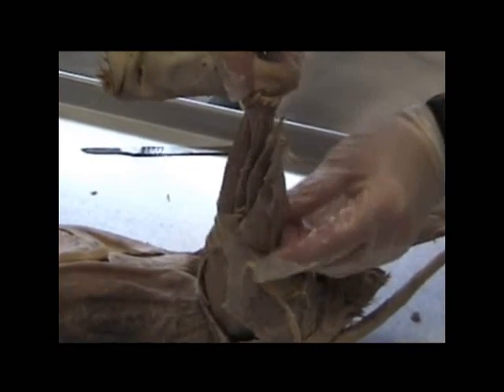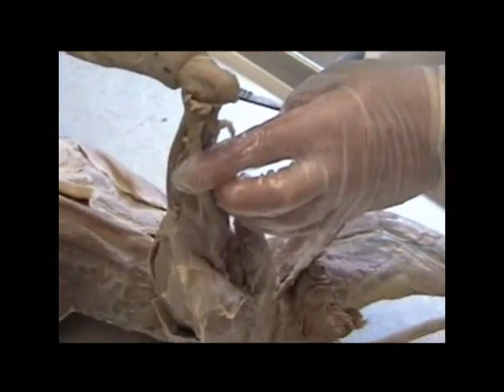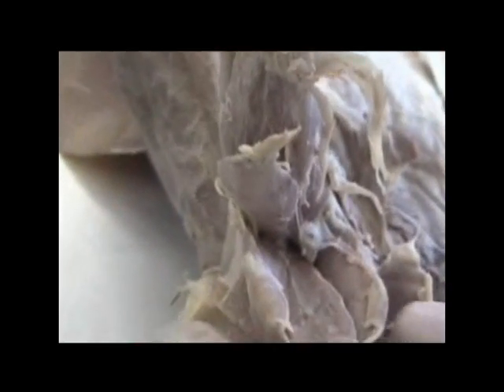Moving to the lower leg now, we have the calf group, and we have cut through the Achilles tendon or calcaneus tendon that wraps around the calcaneus bone, and now we can pull back those calf muscles, and we see the large calf muscle, the gastrocnemius, composed of the lateral head and the medial head of the gastrocnemius, and running down through the belly of that we have the plantaris muscle. Right here we have the plantaris muscle, and then closer to the leg we have the soleus muscle. And so those collectively make up the calf, again, that help to extend the foot.